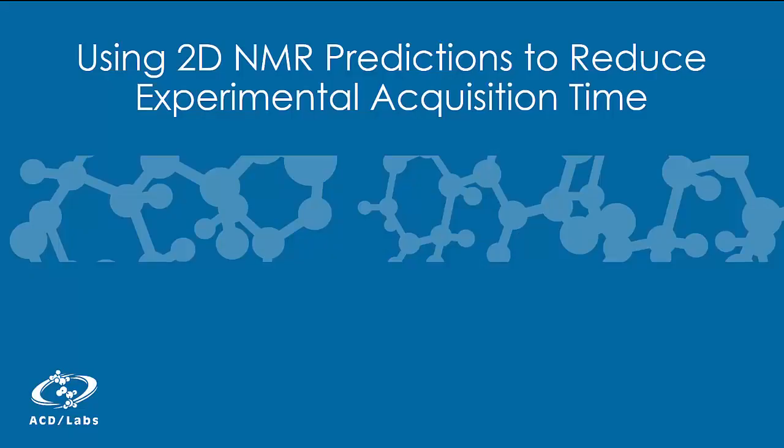This short video will show you how ACD Labs NMR predictors can be used to plan your experiments and reduce instrument time. To watch the full webinar or to contact us, please follow the links listed below the video.